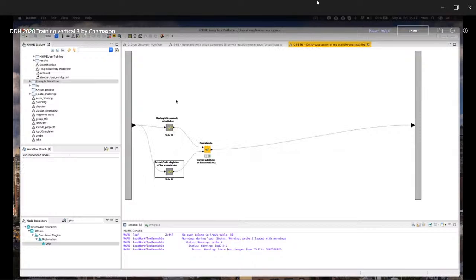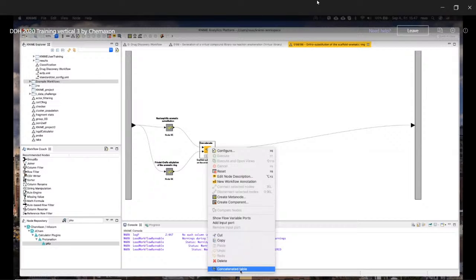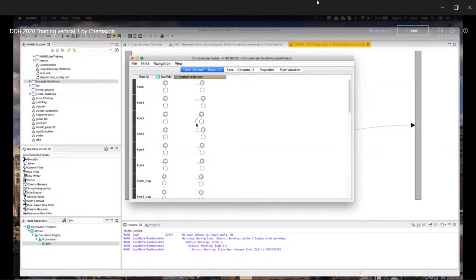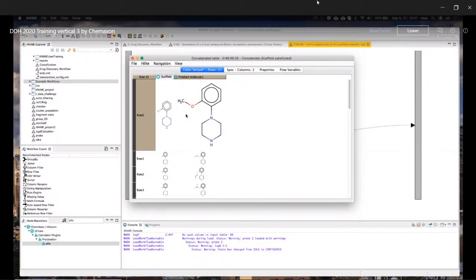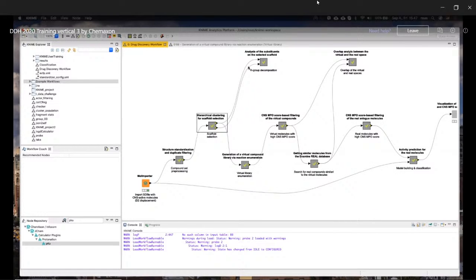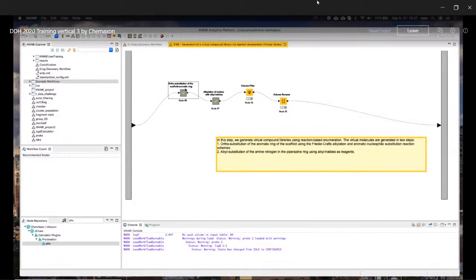Okay. So then we want to concatenate these two molecule or reaction pathways, and from the concatenation of these ones, we are gonna end up with 27 different product molecules that all aimed to decorate our aromatic ring in the ortho position, right? We just played it with Friedel-Crafts and the nucleophilic substitution.